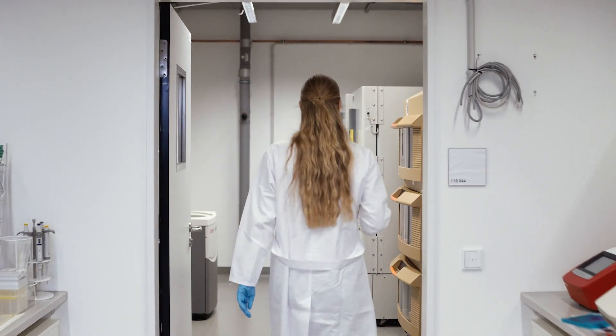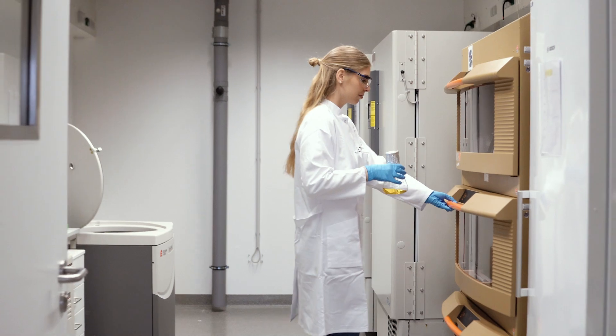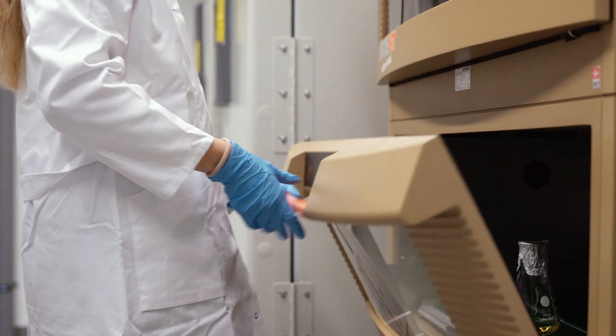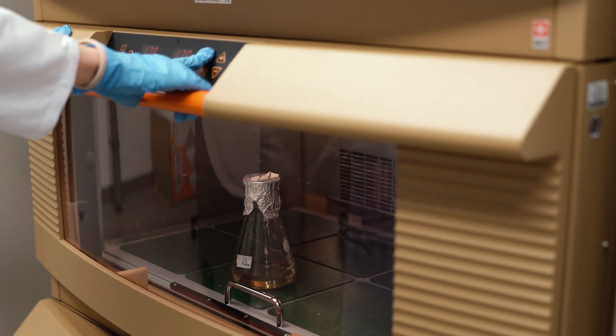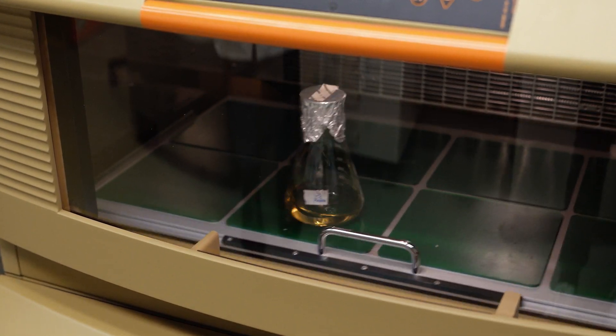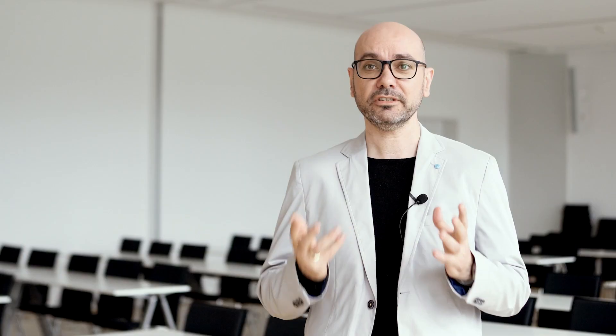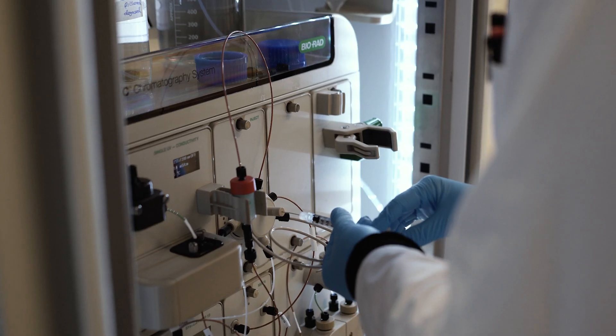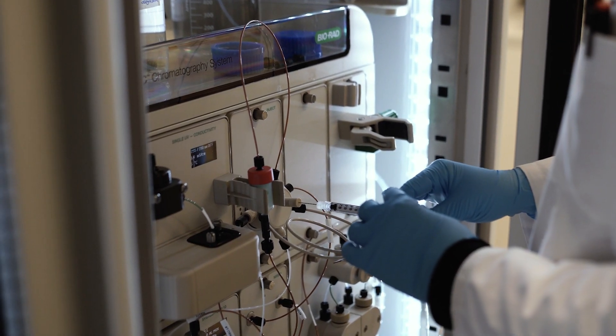These cell factories can be yeast cells, bacteria, insect cells, or very often human cells. We have to maintain our cell cultures and produce high amounts of the target protein. Then we use special protocols for the separation and purification of the target complexes — separating them either based on size or affinity. After a final quality control step, we proceed to vitrify the sample.